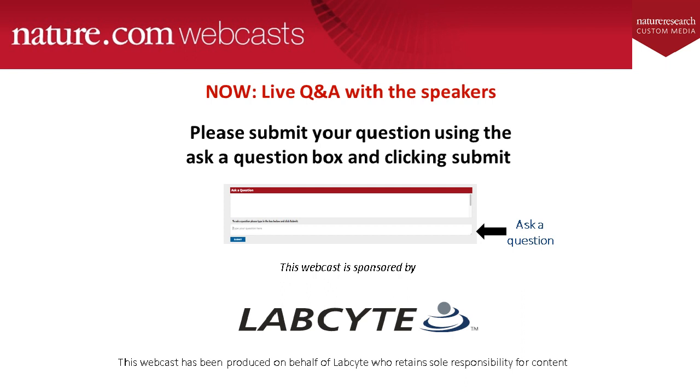Thanks for the nice question. The answer is yes. You can analyze any sort of high-error long-read sequencing, like from both Oxford Nanopore or PacBio sequencers, using the CosmosID platform.